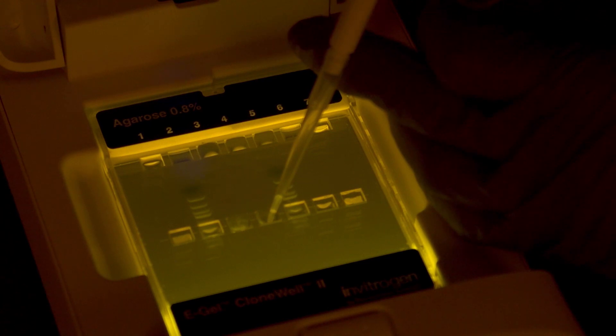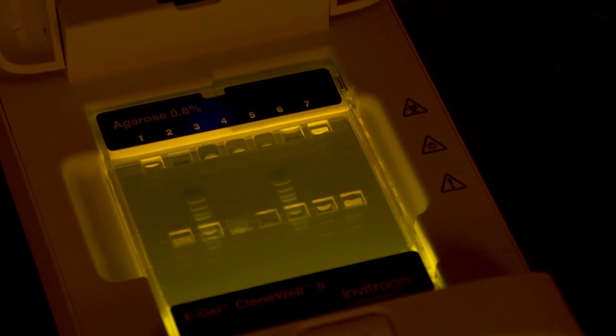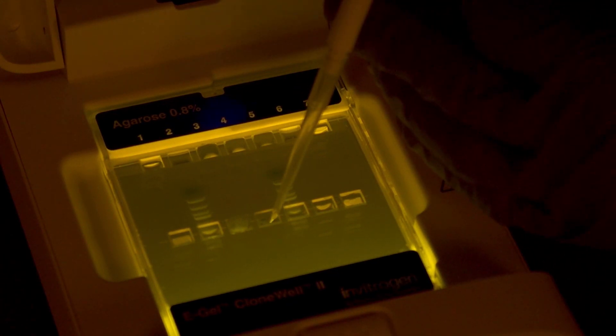Don't worry if you miss the band of interest. Use the reverse protocol to guide the band back into the recovery well if needed. Your sample is ready for use in downstream cloning workflow.